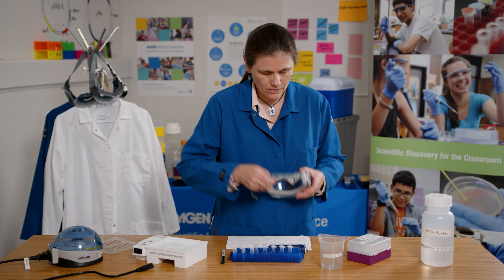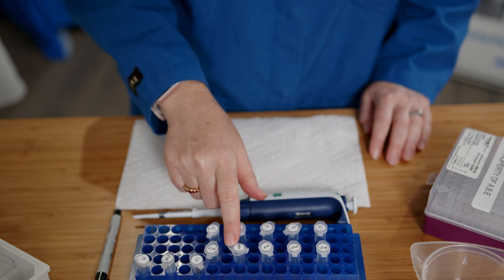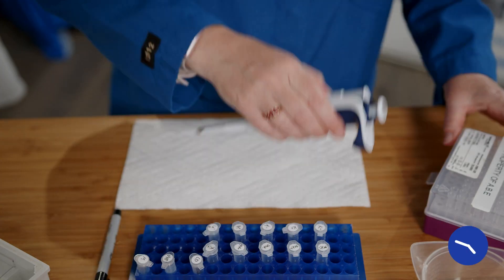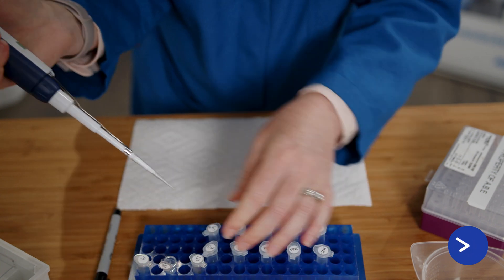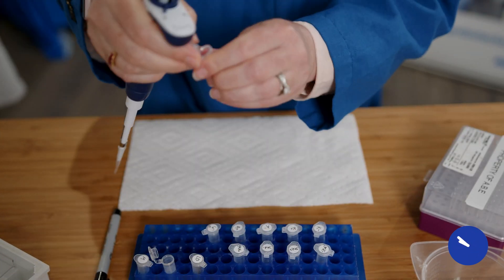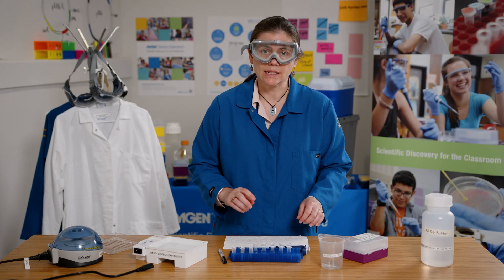Now I'm going to add the reagents to my tubes. I'll start by adding four microliters of distilled water to my GEK-, GEK+, GEA-, and GEA+ tubes. Then I'll add three microliters of distilled water to my GE-Lig tube. Then I'll add two microliters of loading dye to each of my samples.